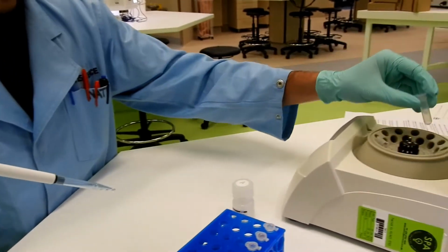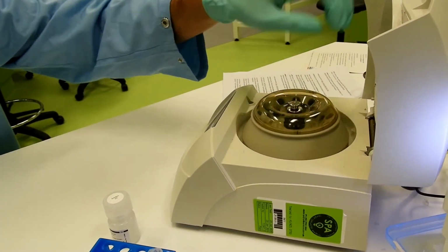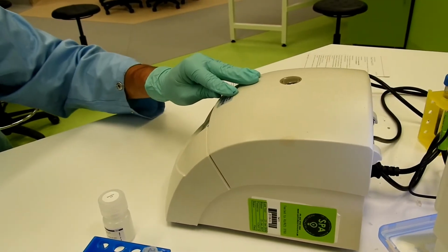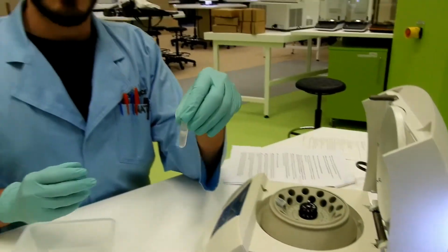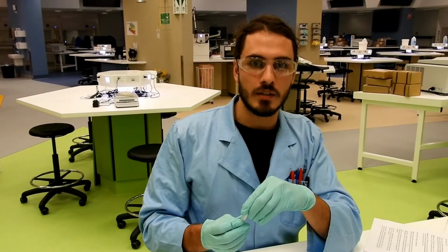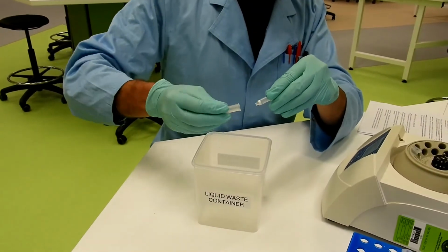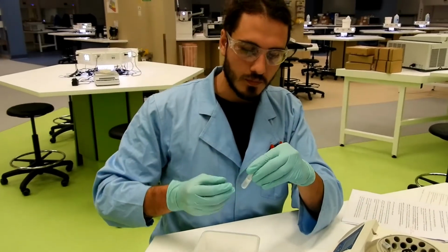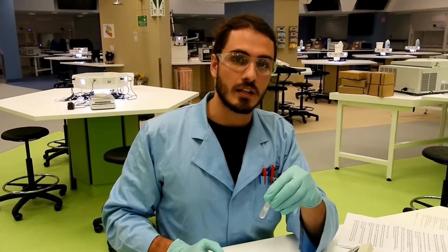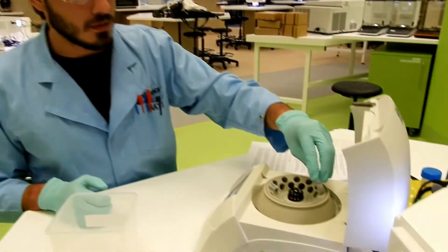We'll then centrifuge for 1 minute at 10,000 g. Now we'll discard the flow-through. This flow-through contains non-DNA contaminants removed by the ethanol. We'll then centrifuge again at 10,000 g for 1 minute to remove any residual ethanol.